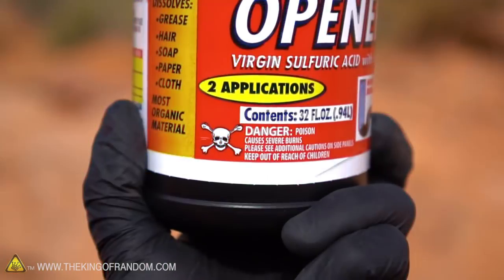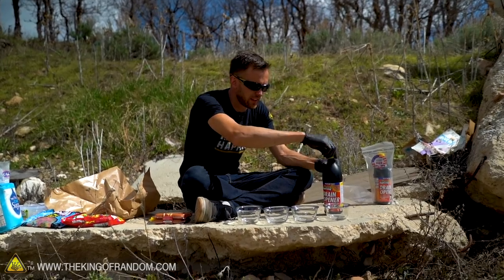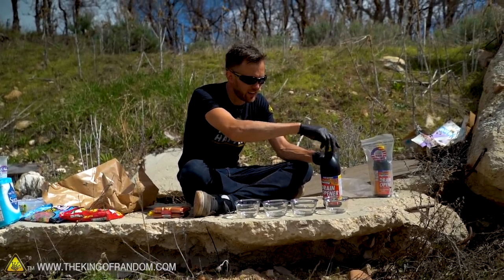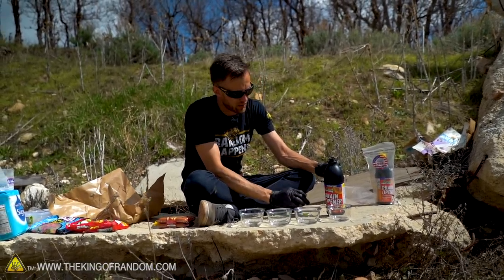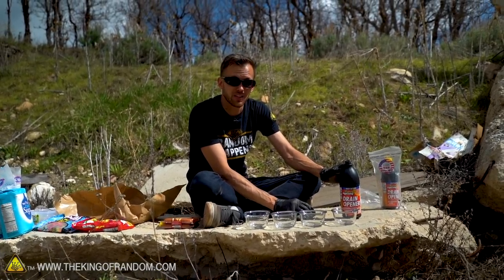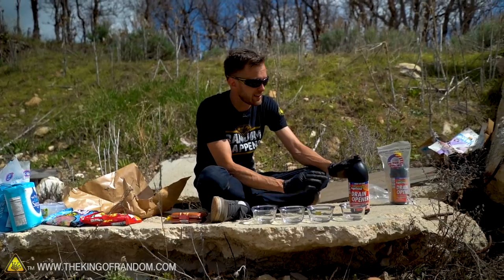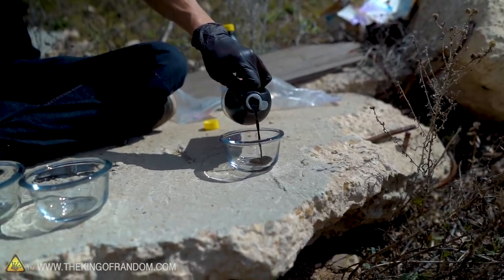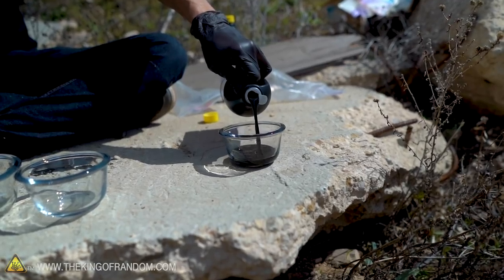This sulfuric acid is dangerous stuff, so of course I'm wearing gloves. I'm in a very open, well-ventilated area and I've got eye protection, which I'm keeping on at all times. I also have a large bucket of water mixed with baking soda nearby, so if I get anything splashed on me I can rinse it off — the baking soda water should neutralize the acid as well as wash it off.